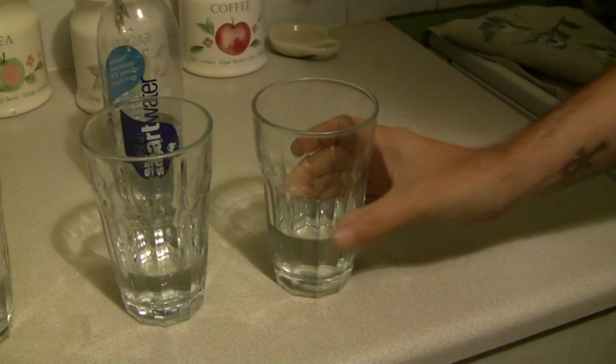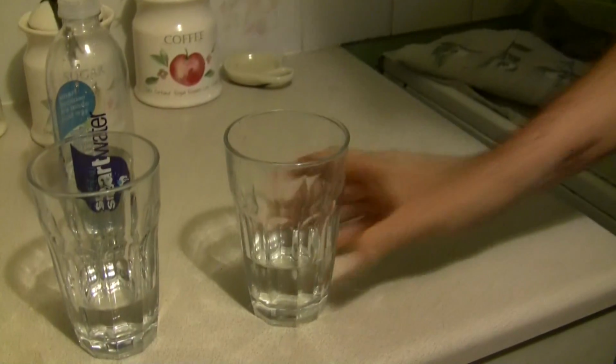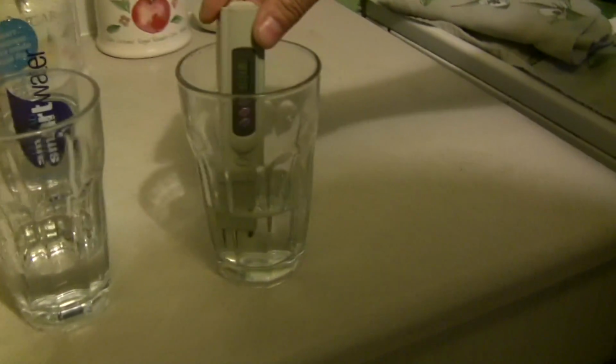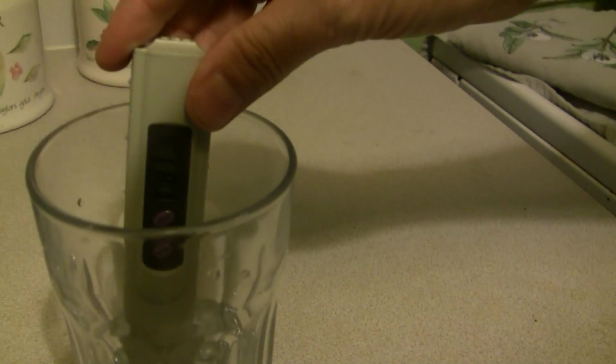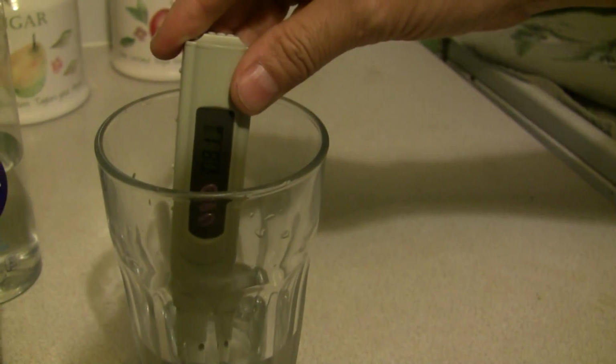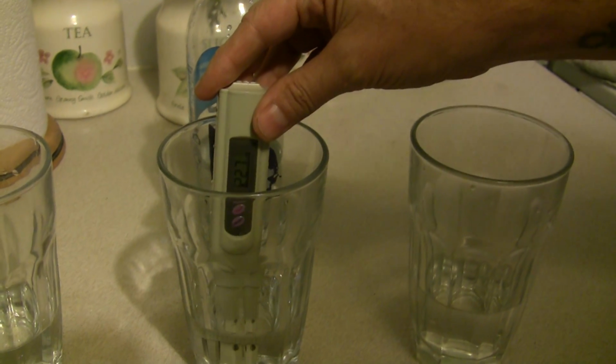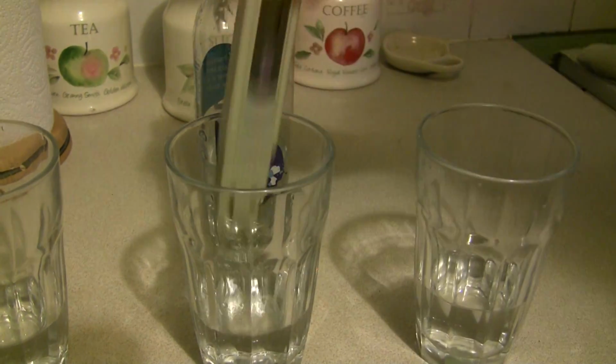All right, but here we've got tap water, so you're waiting for the worst result, because tap water is going to be bad, isn't it? It's going to be much worse than bottled water. And so our tap water is, wait a minute, 81. Wait a minute, tap water is cleaner than the bottled water, which is 228. So never assume that the water that you buy in a bottle is going to be better than the tap water. The bottom line is it's actually better to drink from a tap than it is to drink this bottled water.